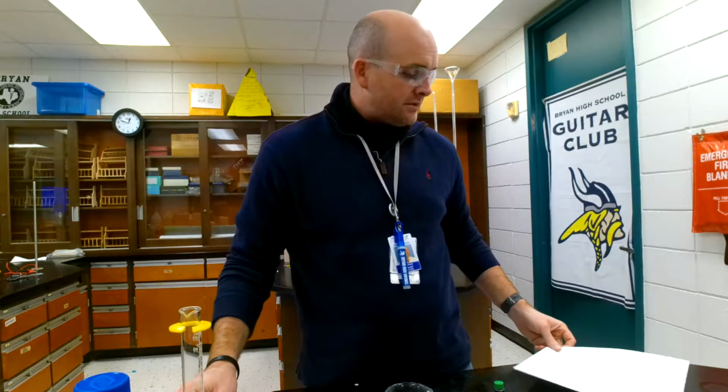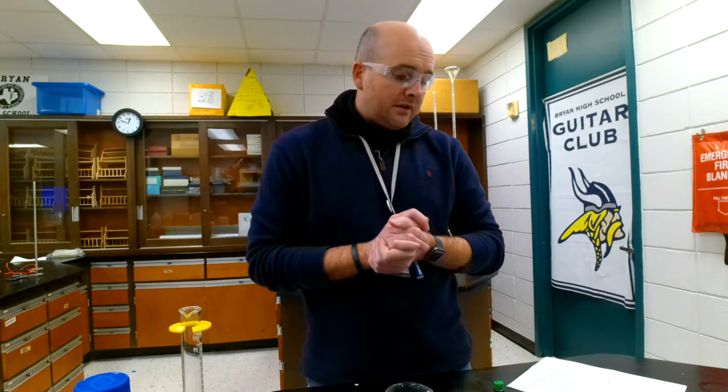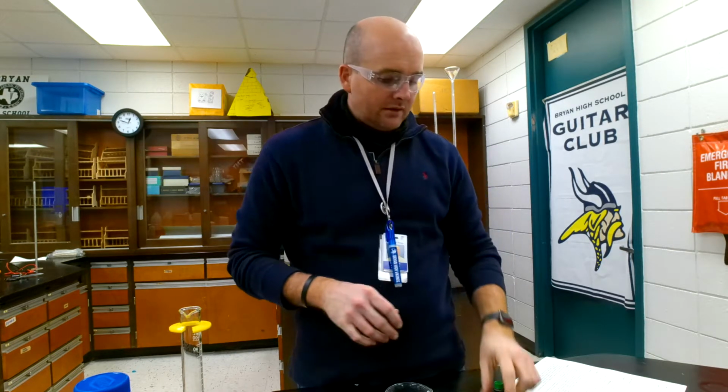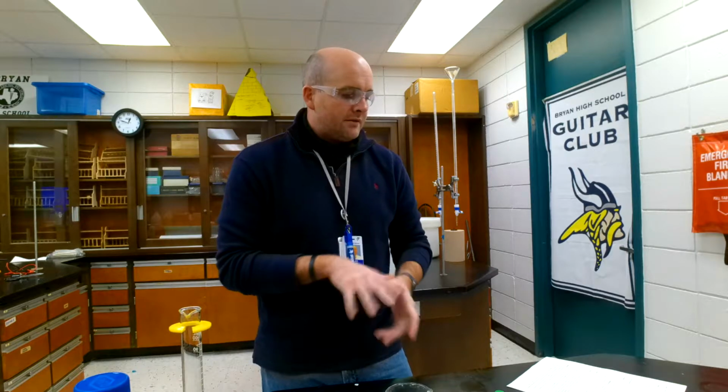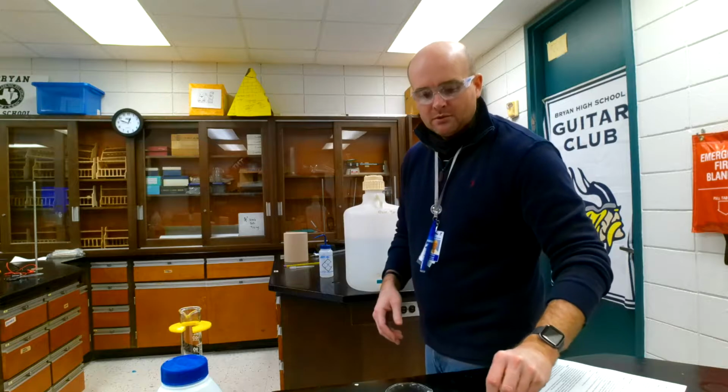Alright, so this is very simple. Your lab procedure says to use 100 milliliters of water and 10 milliliters of chlorine bleach. Now that is a little too slow with this food coloring, so we are going to double the volume of bleach. However, we need to keep the volume of the experiment constant, so in total we had 110 milliliters, 100 of water, 10 of bleach. So we're going to use 90 of water and then 20 of the bleach. So we'll double the volume of the Clorox.